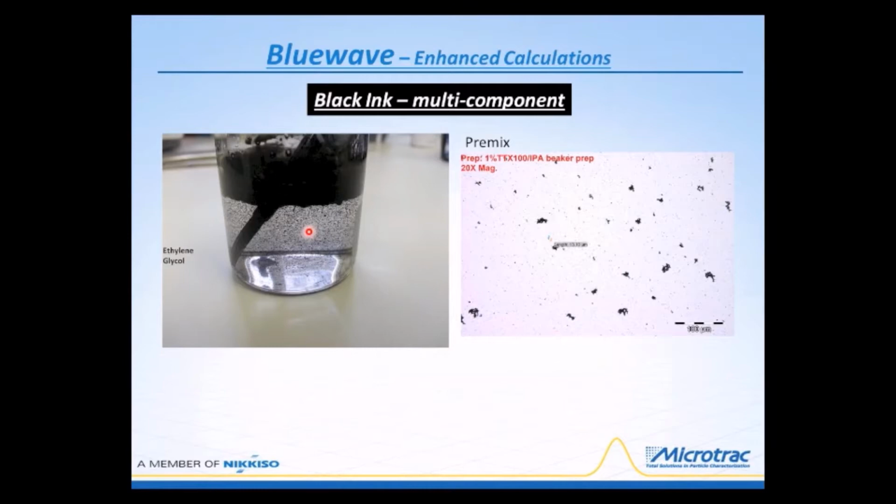And if we were to put this into an instrument, it would cause the optical system, at least the cell, to become dirty, and then it would have to be removed and cleaned and those types of things. So this is a valuable first step anytime you're going to be dealing with any type of an unknown. Well, this is the material.